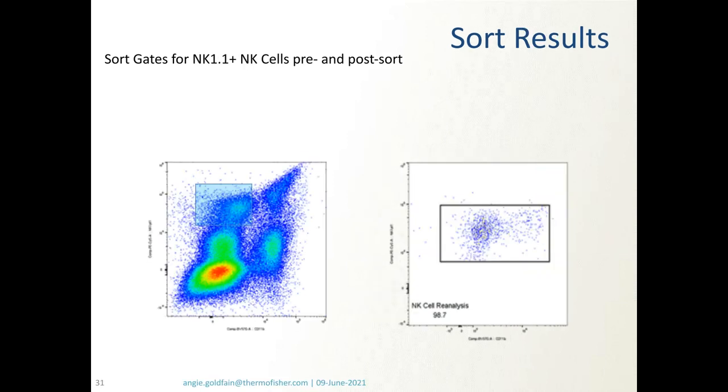And same thing here as we go over to the NK cells. Sure enough, on analysis, they sorted very well. One of the things is this: if you look to the right of the sorted population, we get a lot of cells that I believe were correctly sorted, and I think that spreading we see might be a function of some subtleties in the unmixing that we're looking at now. I'll come back to that.